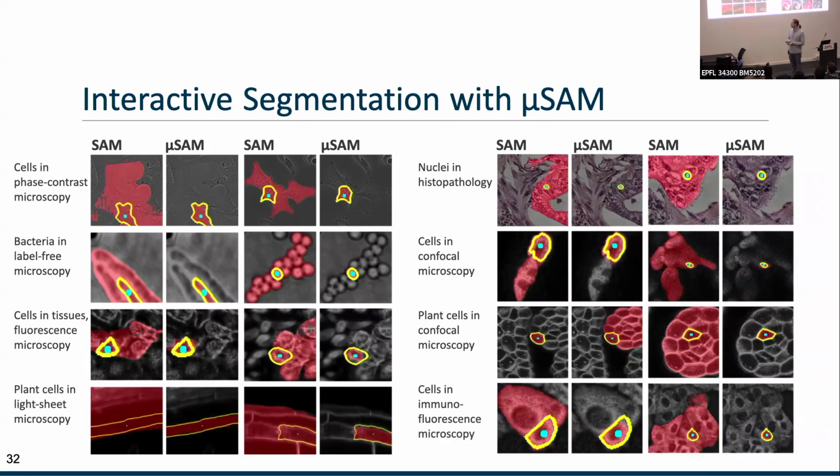Yeah, I mean, there's definitely room for work and improvement there. Basically, the main thing is how to best find representations to be used. And we're also still looking a bit into this, especially now with the 3D. We are looking into this again to see how to do this well for anisotropic 3D data. So yeah, there's definitely room for improvements there, I think. And I hope we can share soon what we do in the 3D case, which is, I hope, now a solution that actually works well, but we still need to benchmark this a bit.